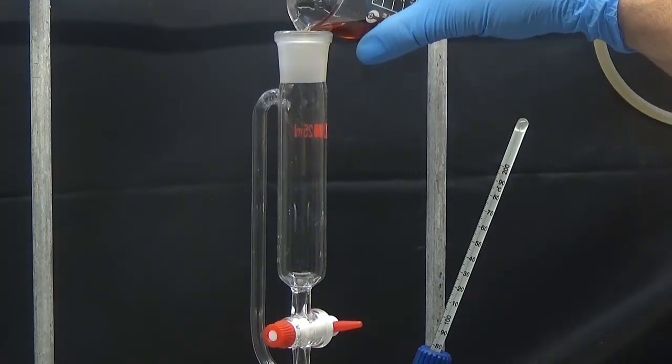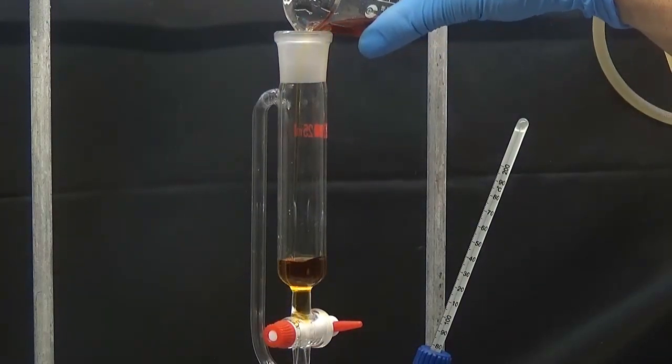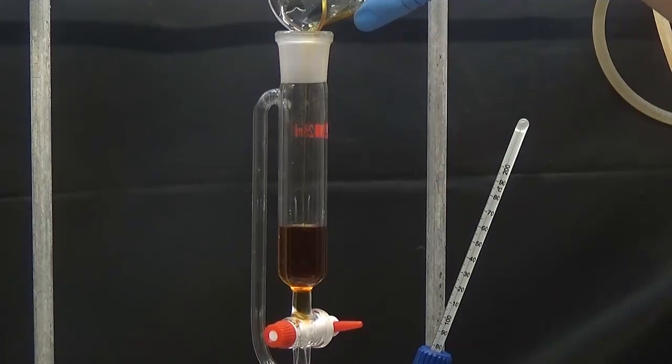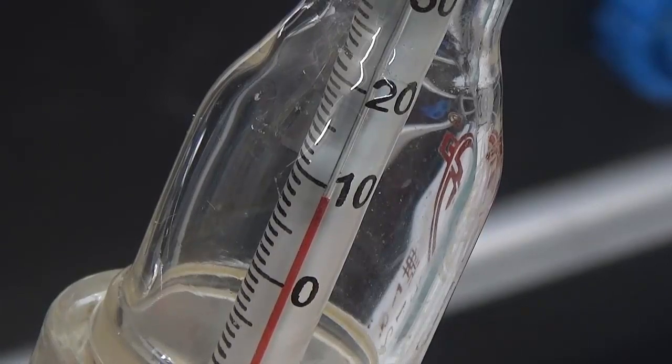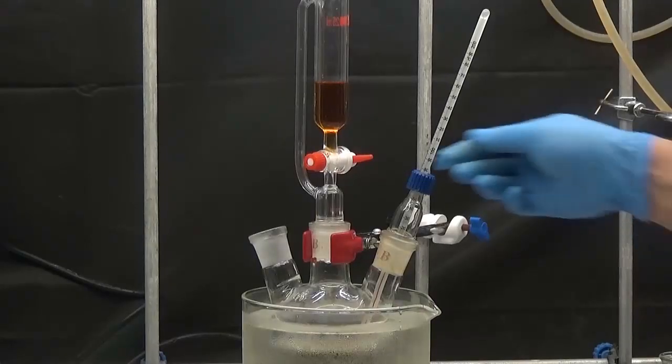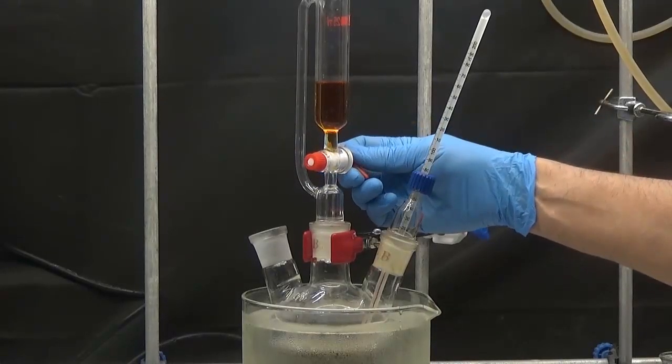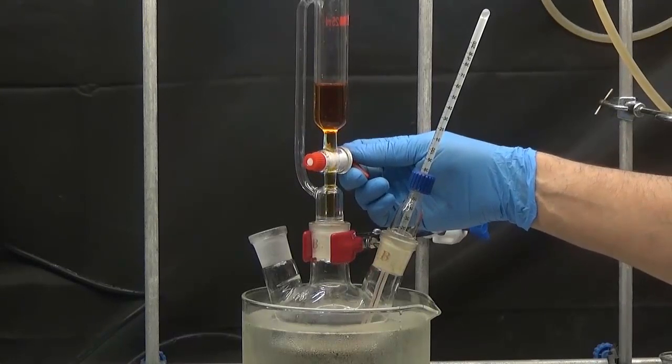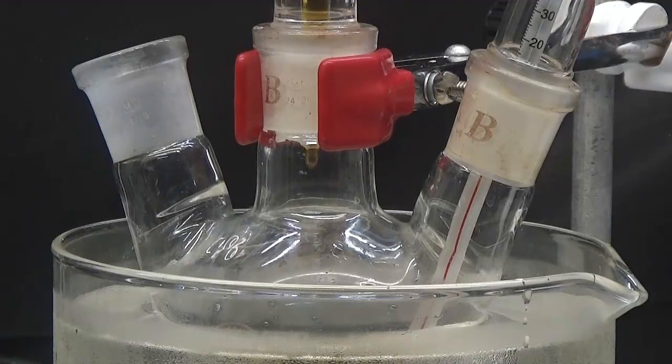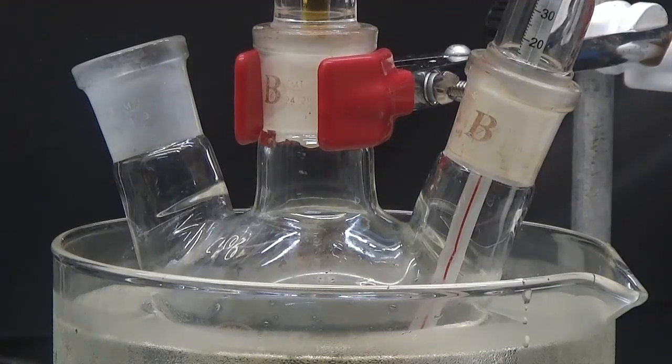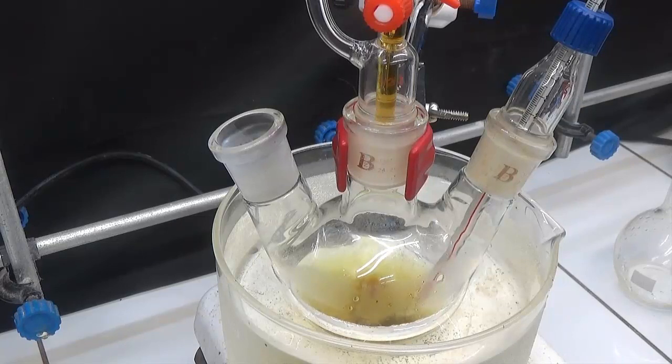We put the resorcinol solution in the addition funnel. Once the temperature of the sulfuric acid is below 10°C, the resorcinol solution is added with a slow drip. Do not let the temperature increase more than 10 degrees Celsius while adding.